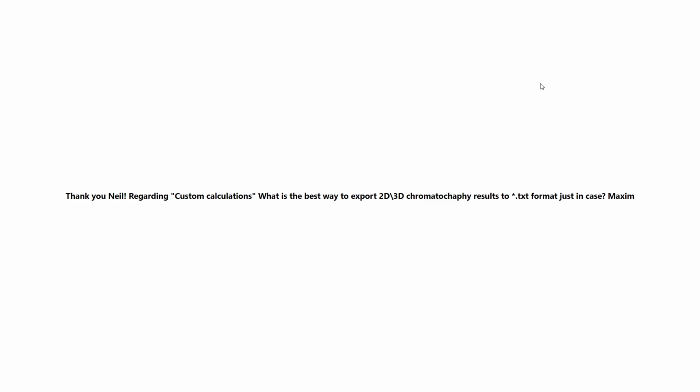Thank you, Neil. That's a great question. Thank you. We have more questions about columns. Next. So the next question is about columns. If columns are not automatically detected, could we manually add column information into the system?